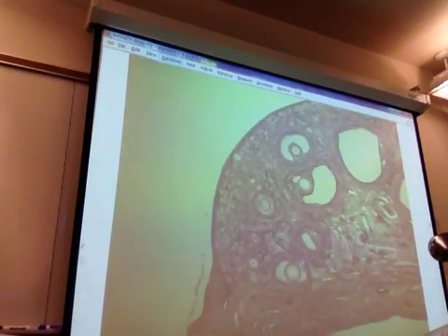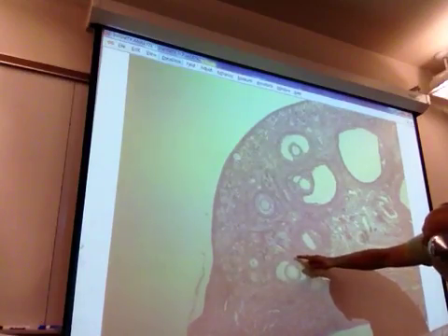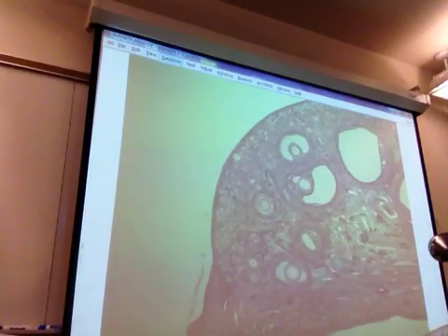Okay. If I'm pointing down here, that's theca. Well, that is theca. Yeah. But what about the rest of that lumen? Are those granulosa cells around the outer edge of the rest of that? No, because the granulosa cells are still up against the rest of it. Like this region right here, are these granulosa cells or theca cells? Those are theca cells. Because I would have thought these were theca cells and these were granulosa. That's what I would have thought. No, they're all theca. Could we go up higher?